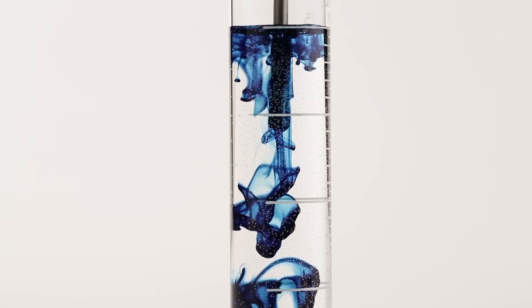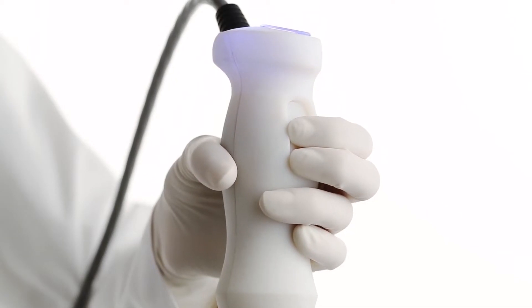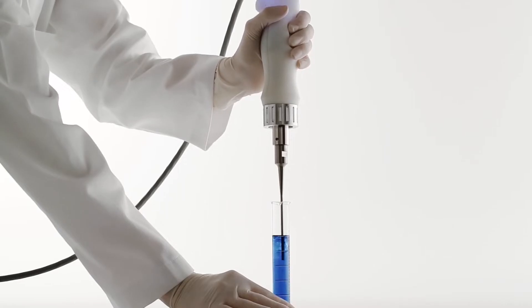The SFX 150 model even includes an ergonomically designed handheld converter so you can do quick experiments on the fly without setting up a converter stand.